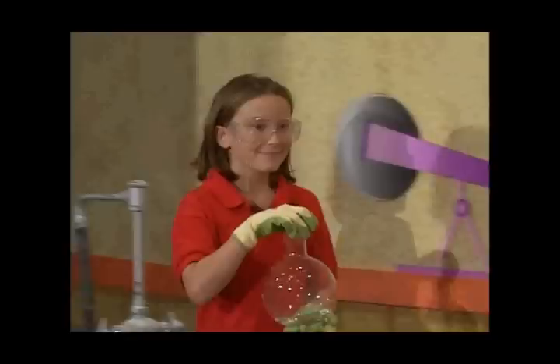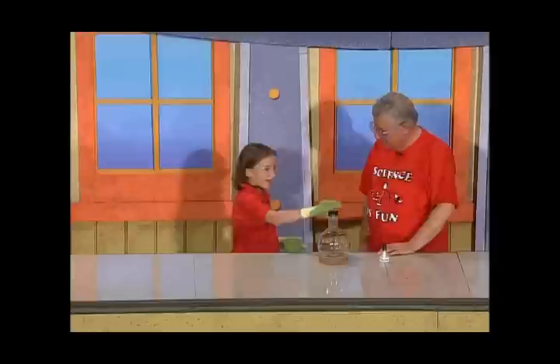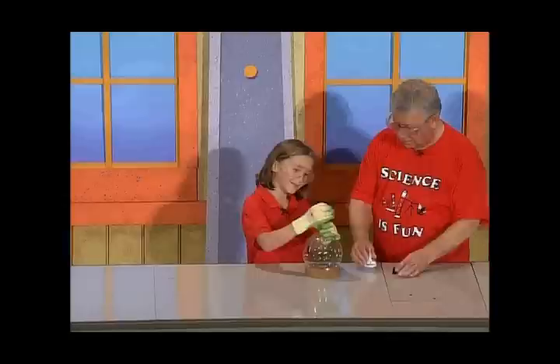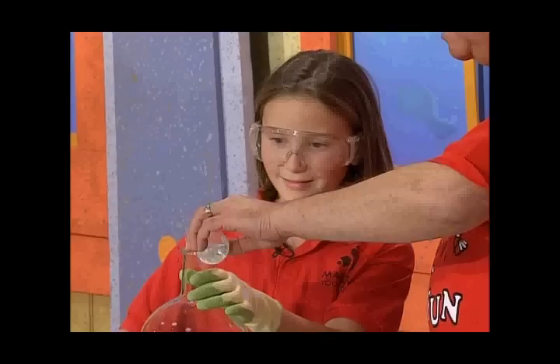To help with the next experiment, I'd like to call on Isabella. Please welcome Isabella. Hi, Isabella. Hi. What have you been working with? I'm working with aldehydes. Al who? Aldehydes. Come on. You know, they're chemicals that smell nice, and some have cool reactions. Oh, yes. I'd like to show you one, but I need one of the chemicals you have. You mean this one here? Yes, that's the one. I got it ready for you. What should I do? Pour it in here. Pour it in there? Yes. I can do that.